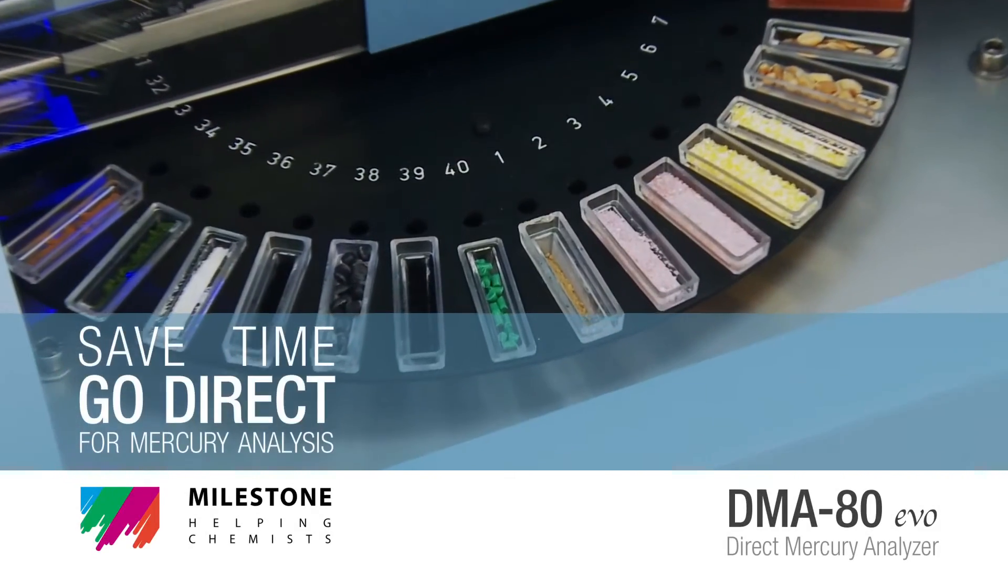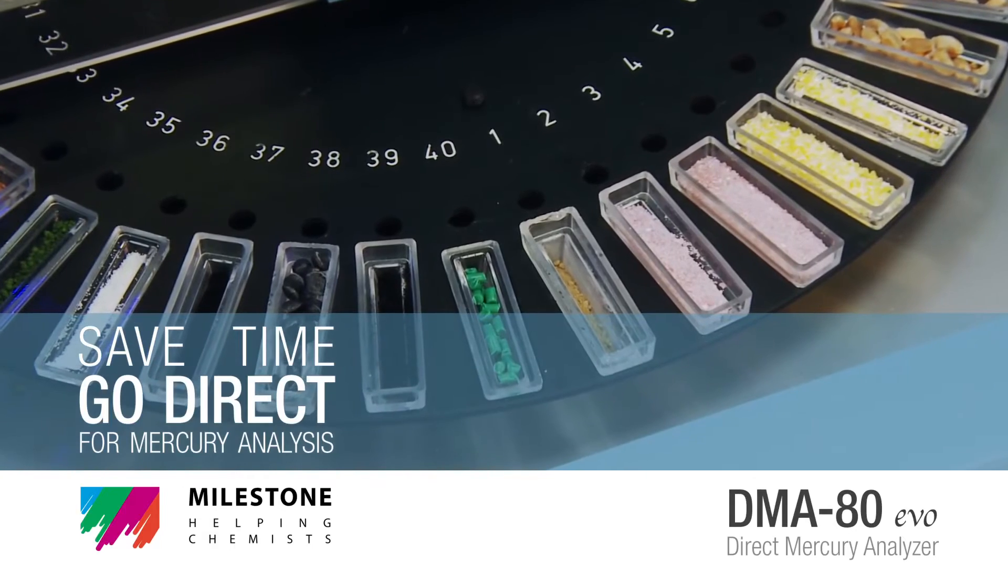DMA80 EVO. Save time. Go direct for mercury analysis.